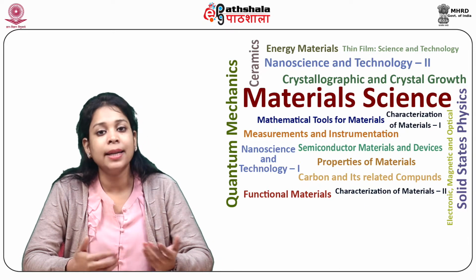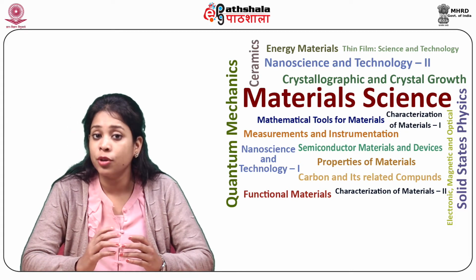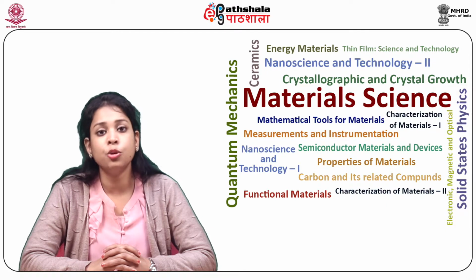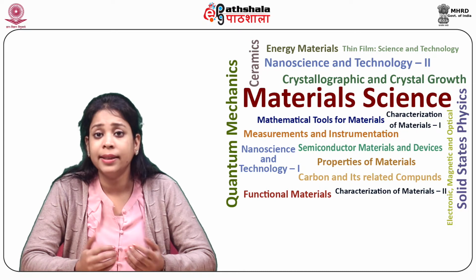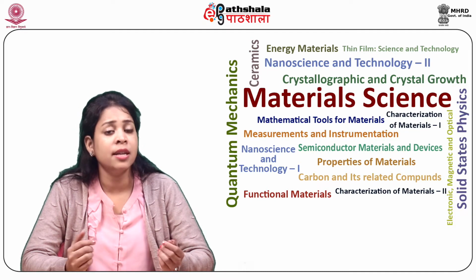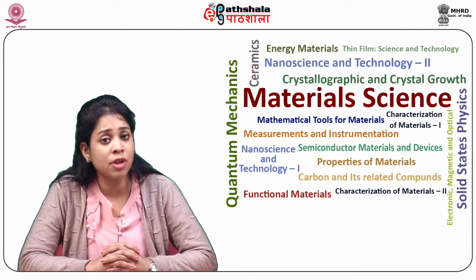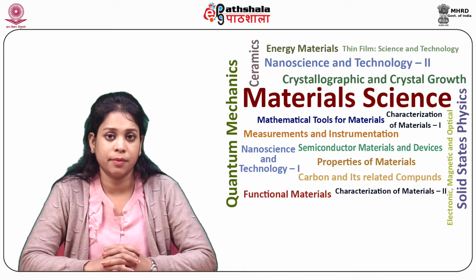Typically, the magnetization decay in the transverse direction is exponential in the case of liquids. So measuring Mxy with variation in time offers information about the local fields, which is important to study microscopic level structures as well as dynamics of materials.